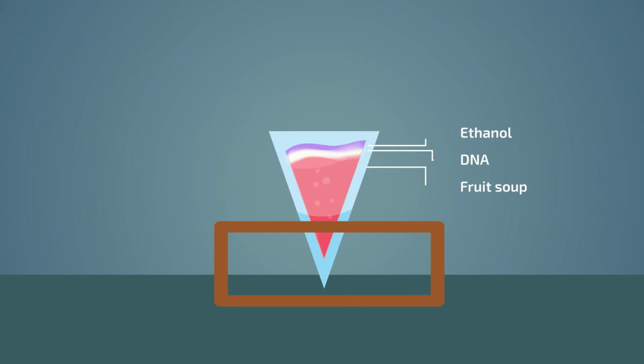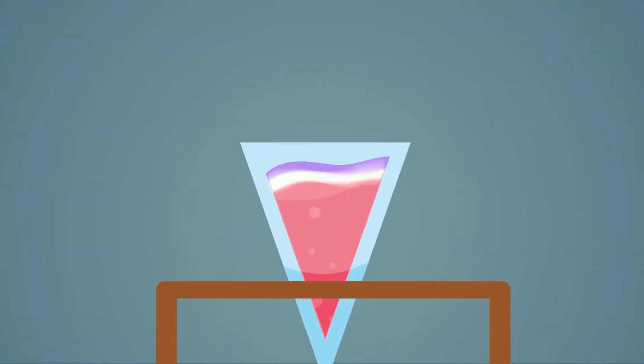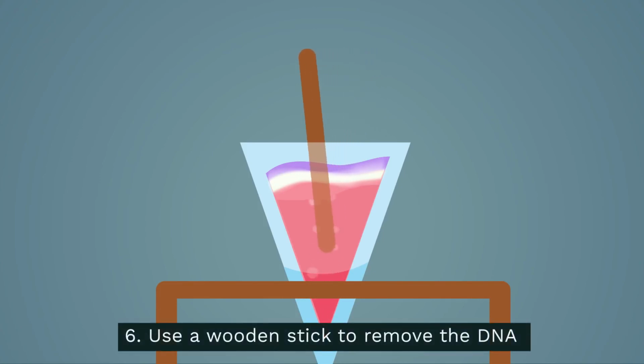You will see cloudy strings of DNA that you can remove by winding around a wooden stick. Here is the DNA. You can then observe this DNA under a microscope or use it for experiments.